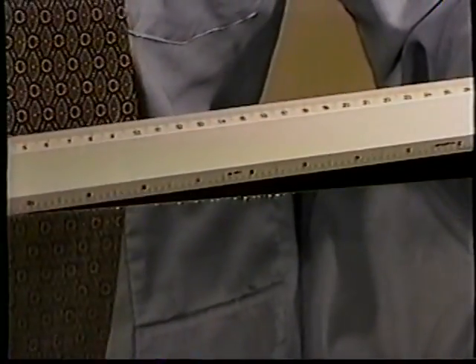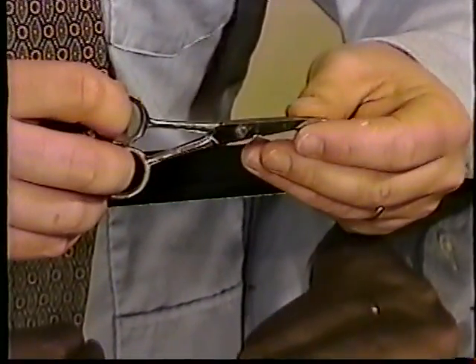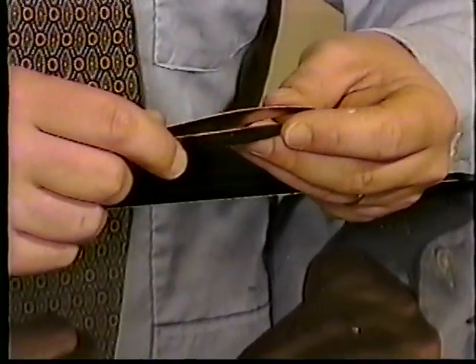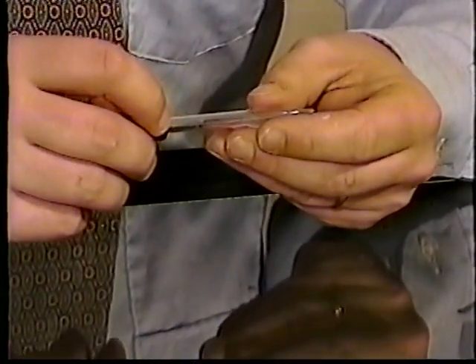We will now take a look at the tools we will use during our dissection. Our ruler will allow us to measure particular parts of our specimen. Scissors will prove to be very helpful in opening and cutting any skin that we run into. Tweezers will allow us to pick out particular organs or parts of our specimen for closer examination. Our dropper will lend itself to collecting any excess liquid we run into during our dissection.